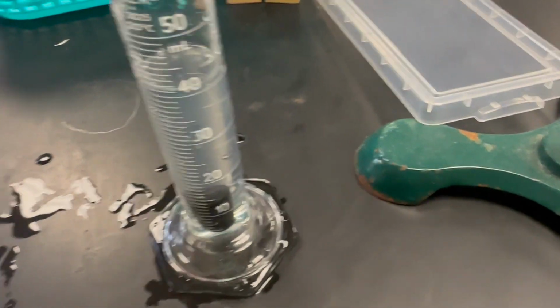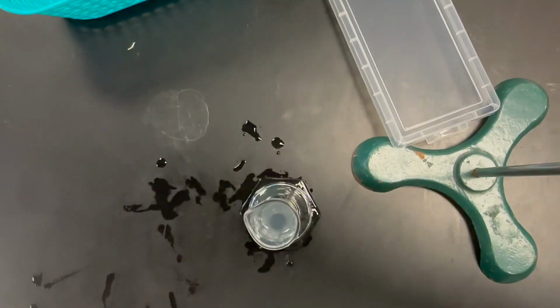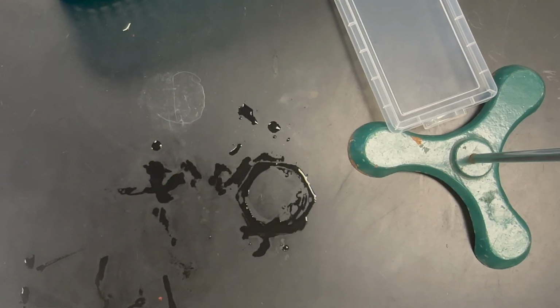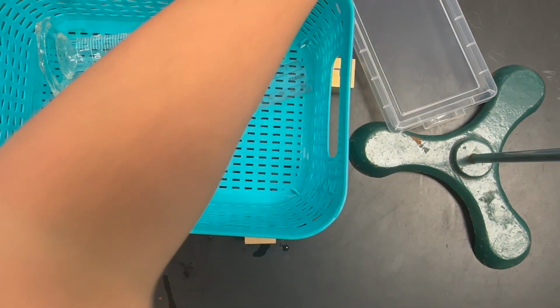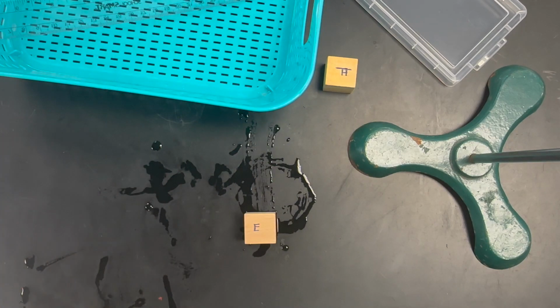So then you have your mass, your volume, and you're able to calculate density. Now, to clean this part up, just dump the water in the sink, and you can throw the graduated cylinder back in, and we'll keep the stopper off to the side. There will be a paper towel up at the teacher's desk in case you want to use that.